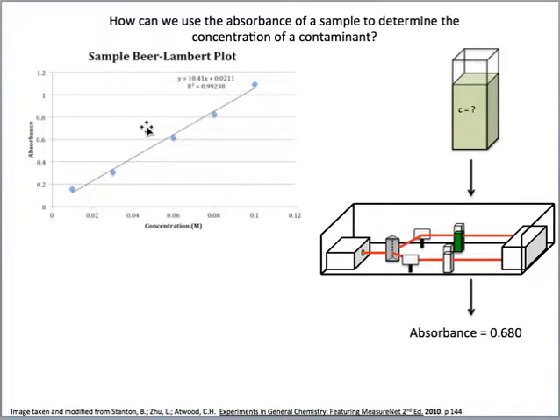So the absorbance of 0.68, I'm going to come about right here and go across. Oh, that's about here, and then I come down, which is about 0.062 or 3. So the concentration should be 0.06 something.